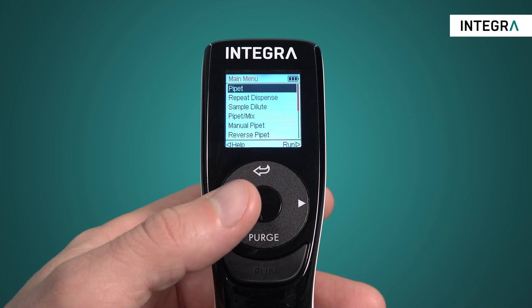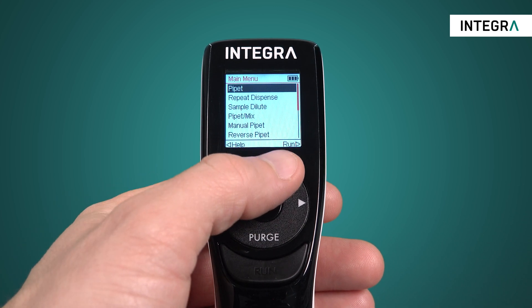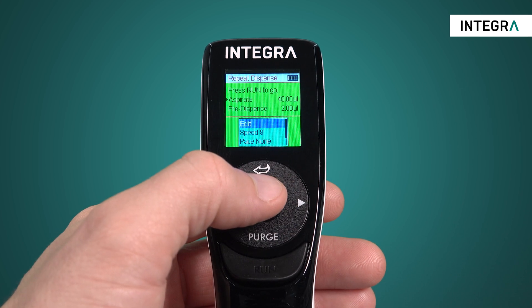Simply enter the repeat dispense mode from the main menu. From here, the run screen, you're ready to begin pipetting. But let's change some of the parameters of our program.